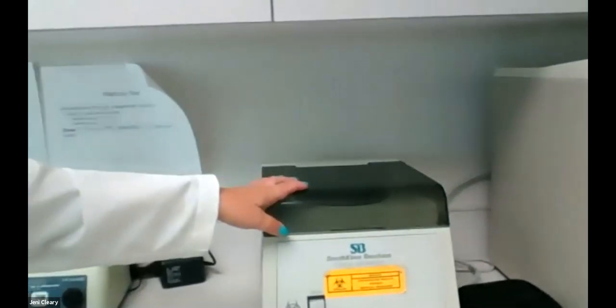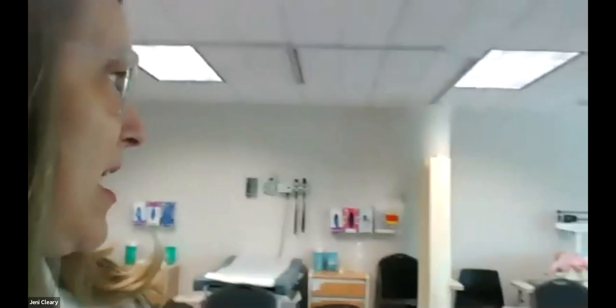This is our autoclave machine where we sanitize all of the equipment that we use. We have a centrifuge where we break our blood down. We have a urinalysis station where we play with pee. That's the easiest way I can say it. We also have EKG machines and scales. We have all kinds of fun equipment in here.